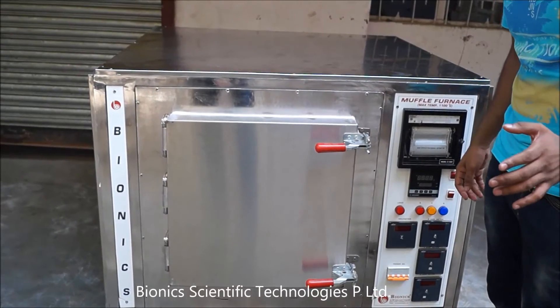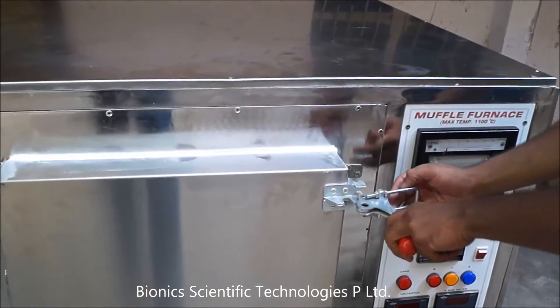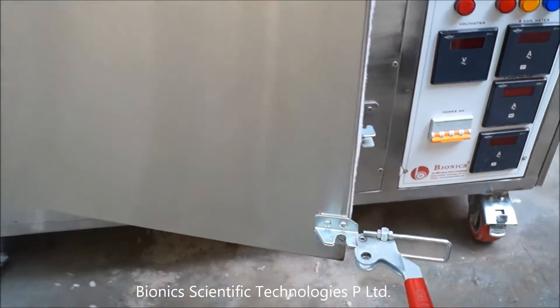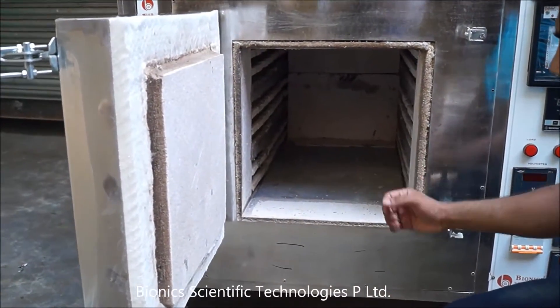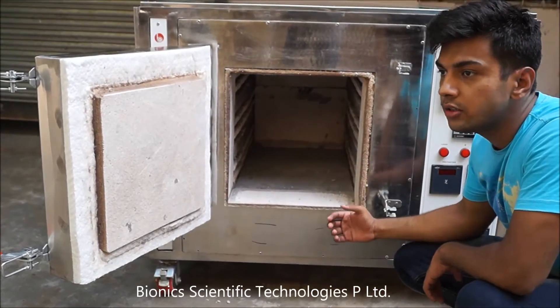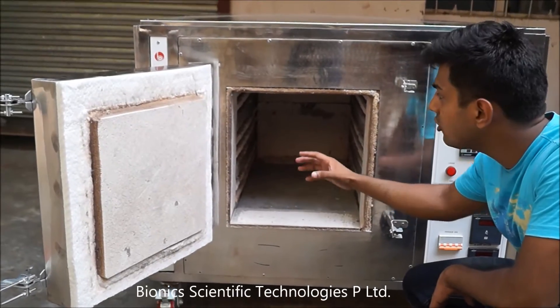To view the chamber, you have to first unlock this block like this. As you can see, this is our chamber.